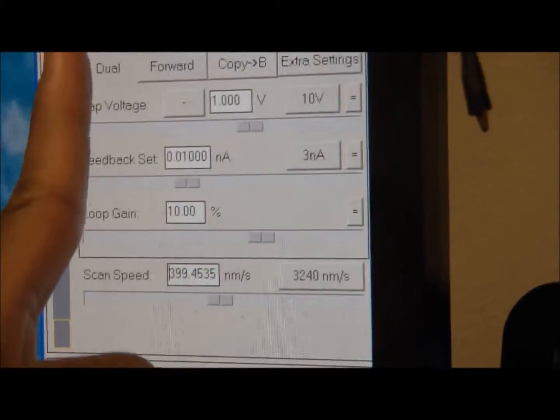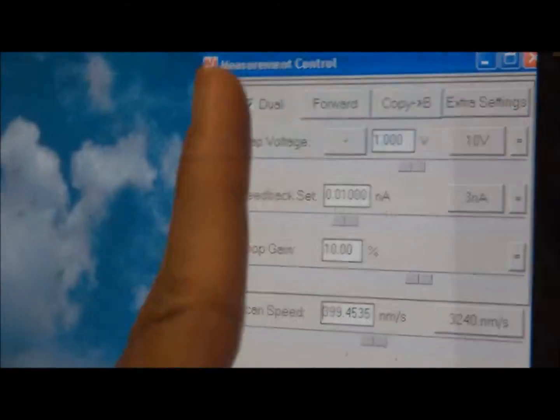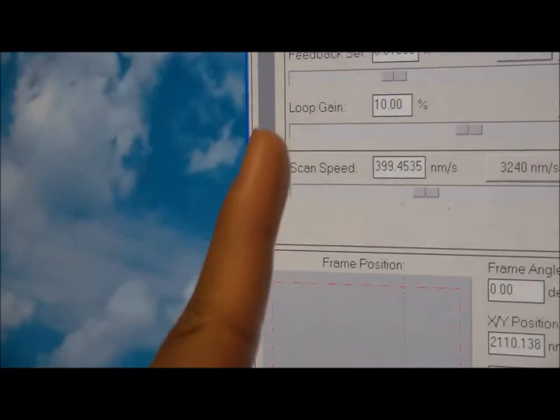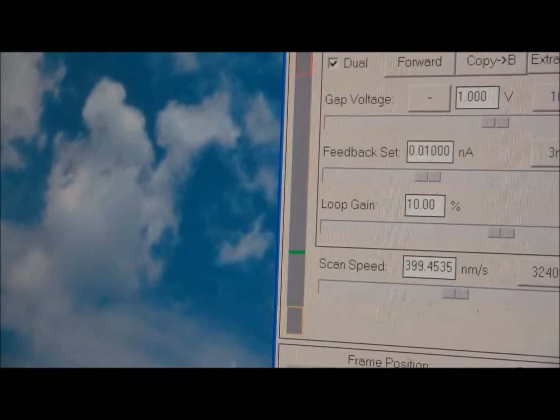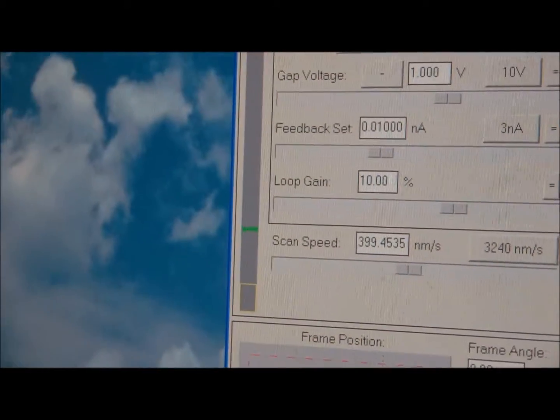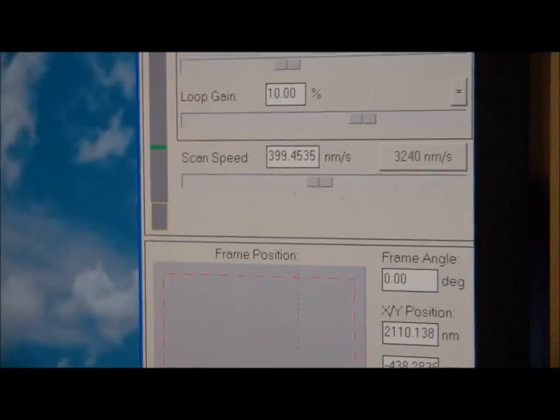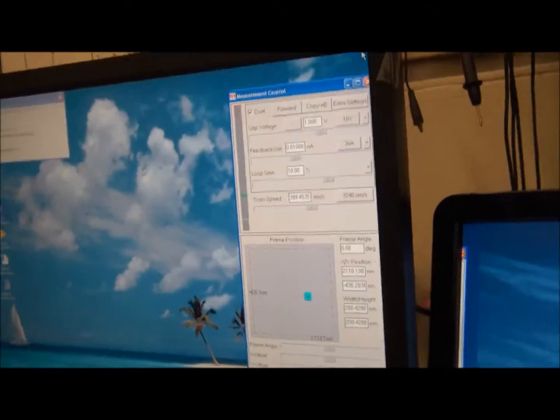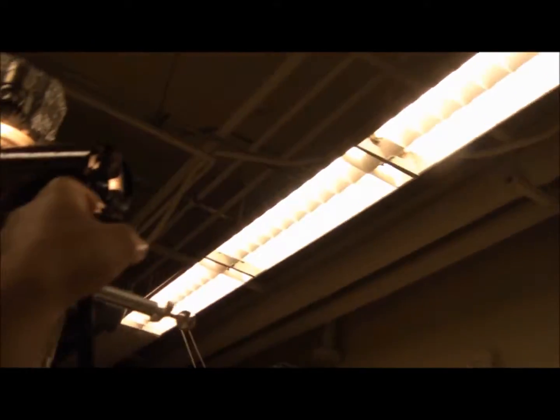You can actually visualize this as a needle at full extension. And this green line is where it is right now — it's kind of like one-fifth, or one-sixth of the way. That's basically the approach process. I have the light on right now, but I'm about to start, so I'm going to cut the light off.